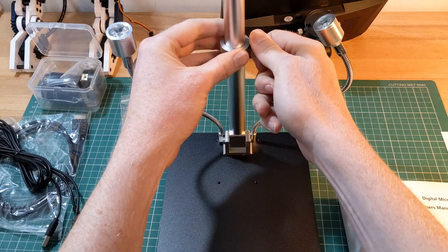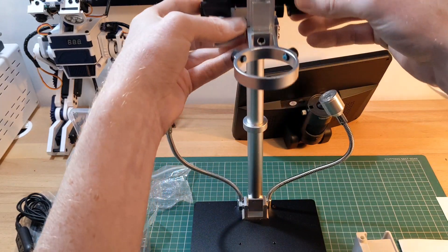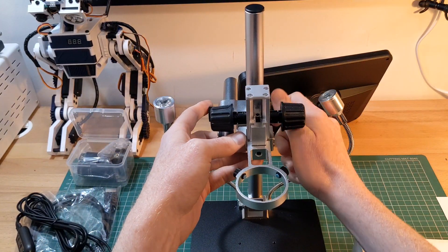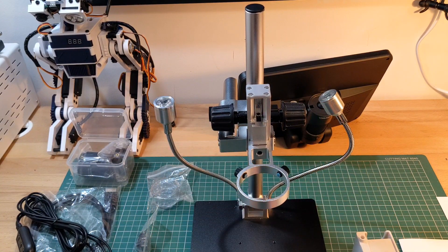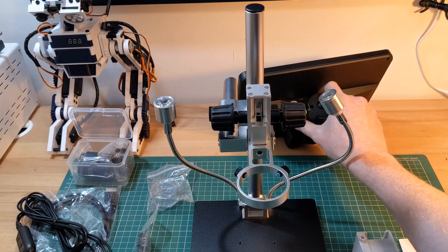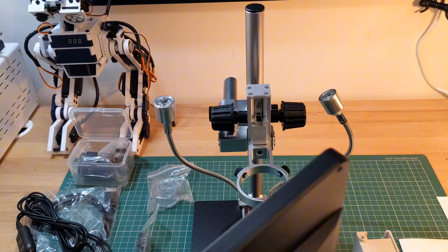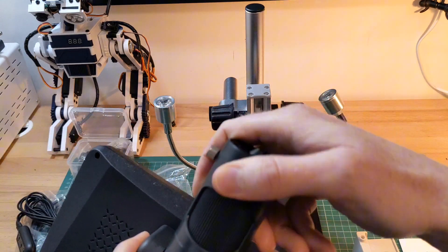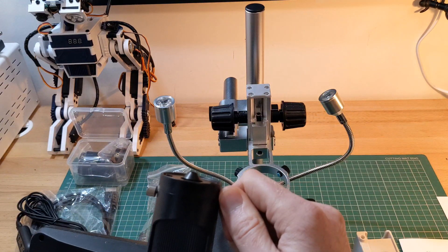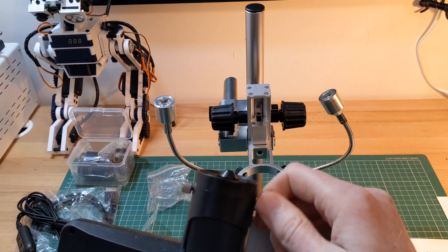There is a safety ring on the arm to prevent the microscope dropping during adjustment. And then above that you can attach the mounting arm. Once the mounting arm is attached we need to unscrew the lens from the microscope, then slide the scope into the mounting arm and secure it with the included screws.